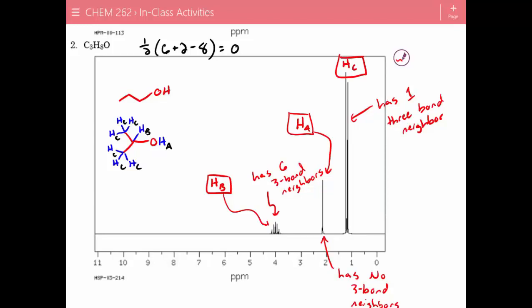Which ones, HCs or? No, the very top box on this carbon with an alcohol. So that would be for HA. If we look at the carbon alcohol one, that's going to be anywhere from 1 to 6. That's such a wide range. Exactly. I'll talk about that in a second, but if we look at HB, we said that HB is attached to a carbon attached to an electron withdrawing group, so it should be about 2 to 4. If we look at HC, it's going to probably be in that 1 to 2 range, which is where it is.